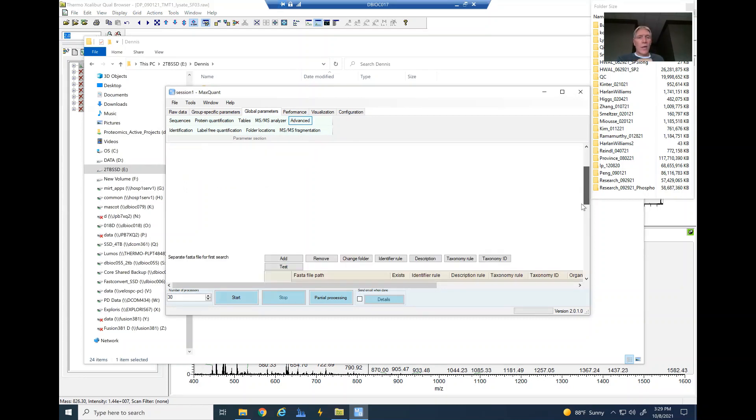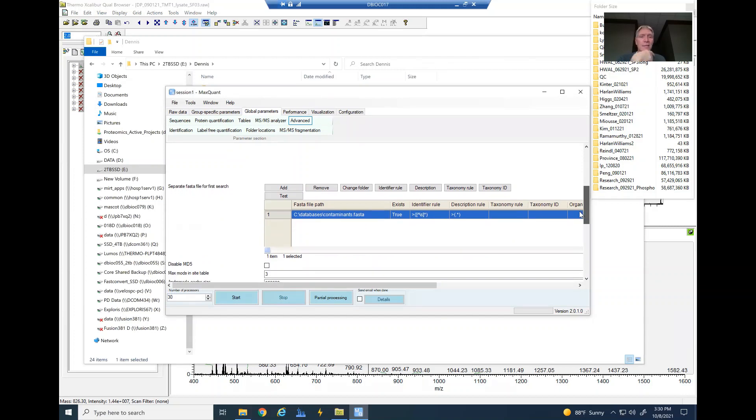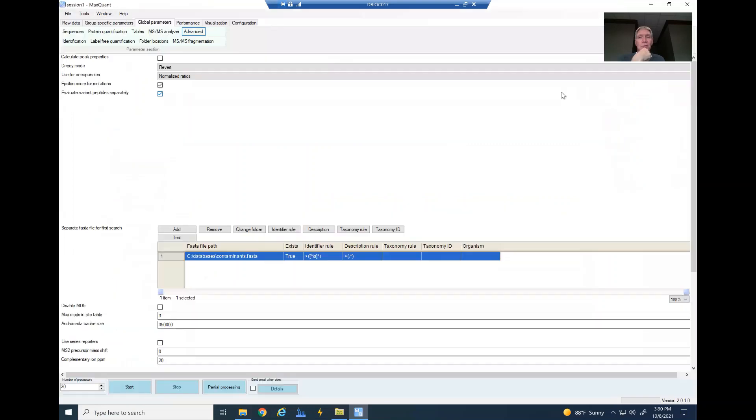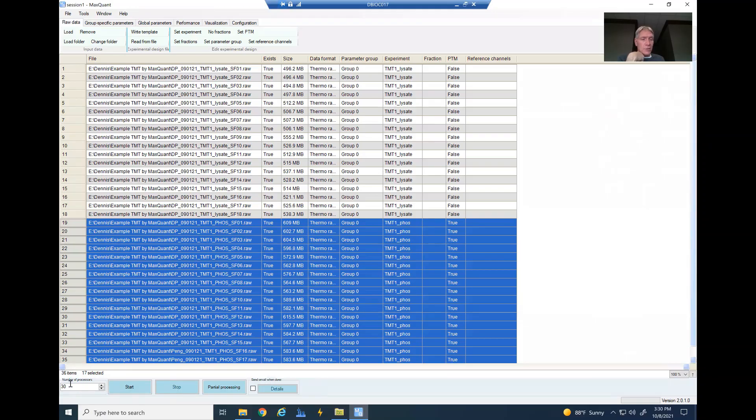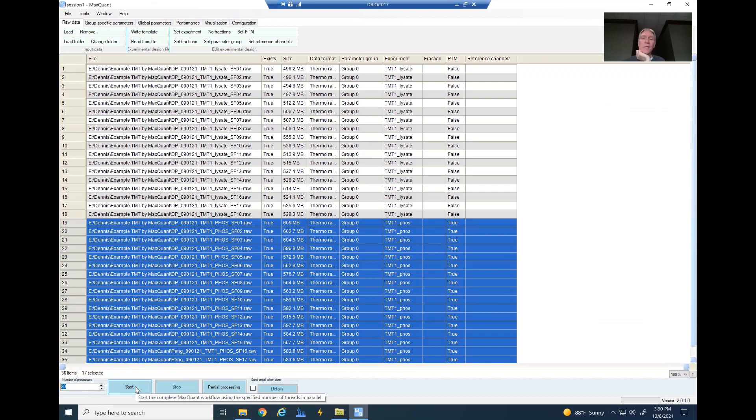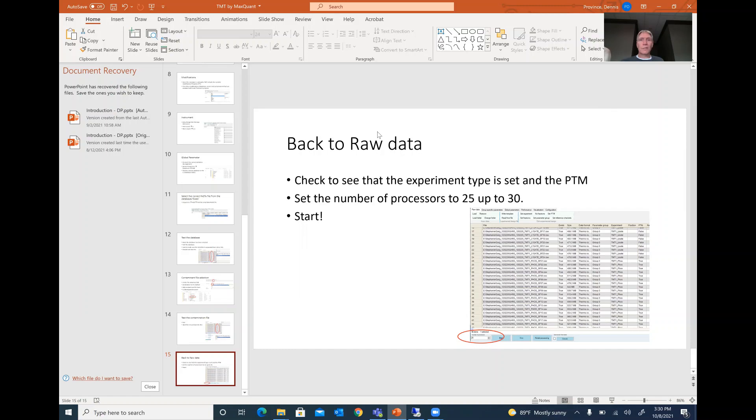Back to your raw data, select your number of processors down here, hit the start button, cross your fingers, and everything should be good. So I think I'm done. I'm going to stop there. I hope this was helpful to at least one of you out there.